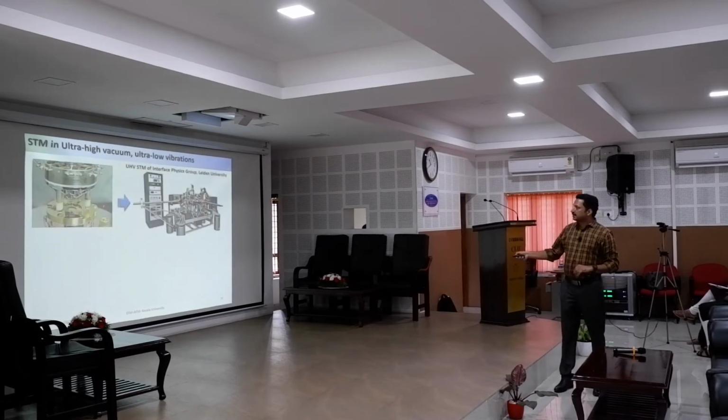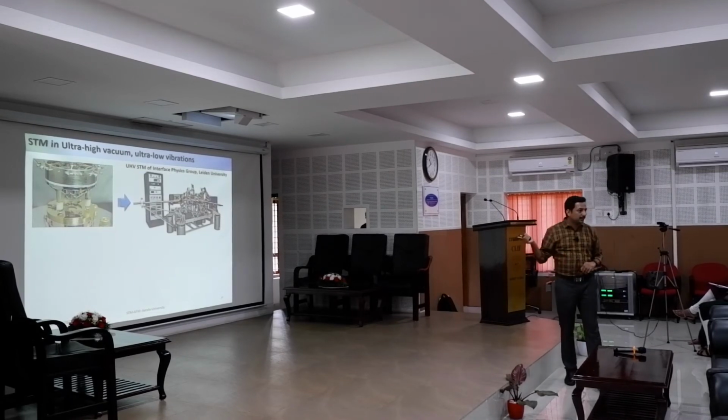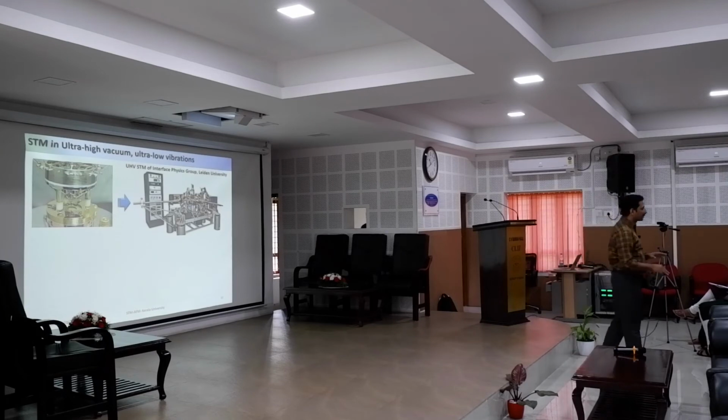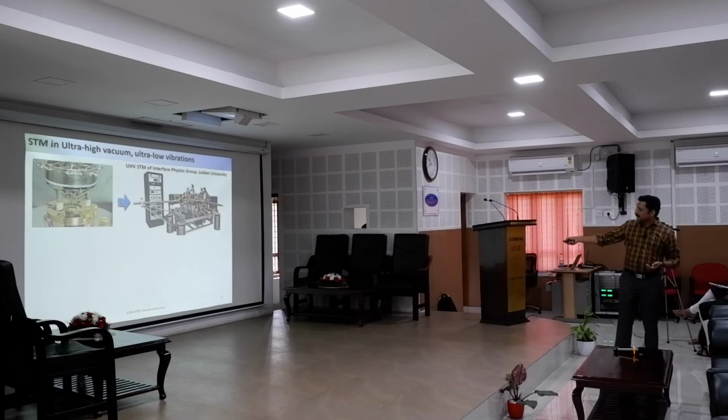Yeah, so this is the initial STM which was made by Rohrer, but this is an STM which we use in Leiden University. That's now very complicated, because it needs vibration isolation. As I told you, the tip is very close to the surface. Now, any small vibration, even the vibration of what I'm speaking, will also affect it. It will crash.